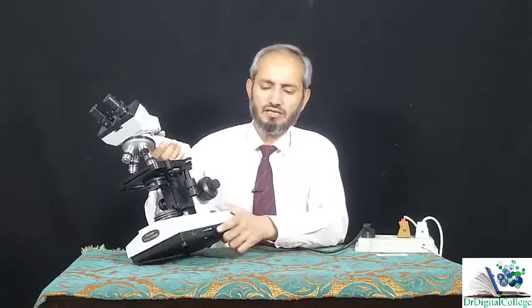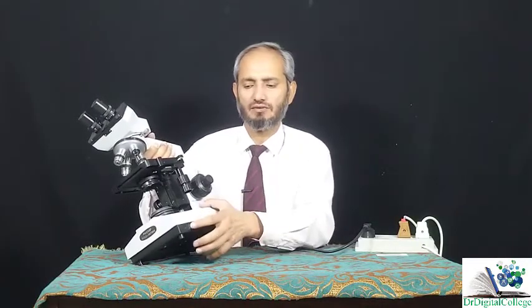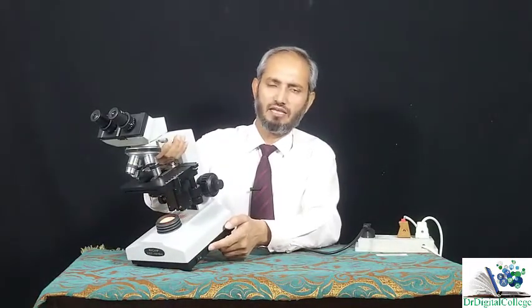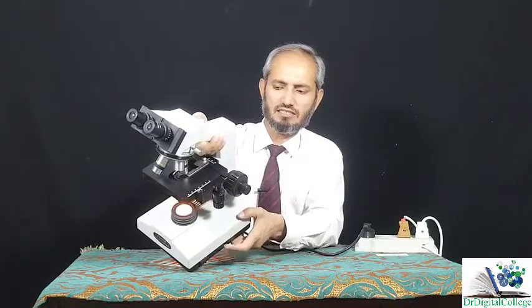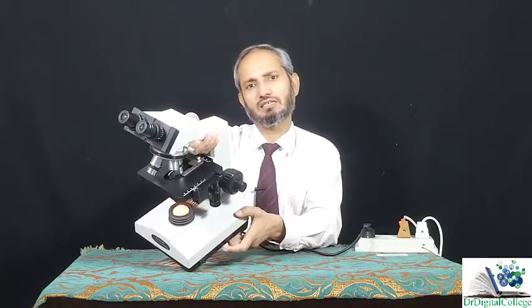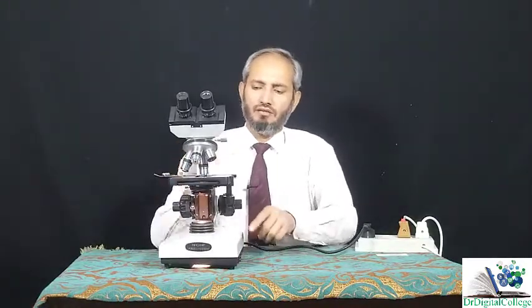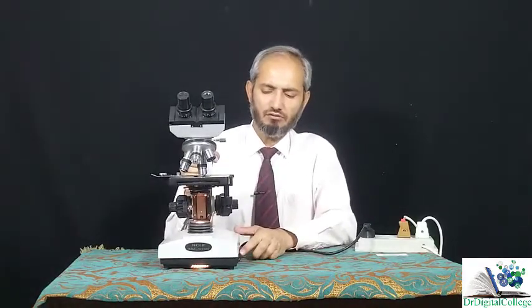Moreover, there is a dimmer here, or you could say a regulator, with which we can increase or decrease the intensity of light. For example, I have the light on now, and with this I can decrease the light and I can increase the intensity of the light. Look at this: you can see that the light intensity is being decreased here, and now it is being increased here by this button. This is the dimmer. For different focusing, we need different amounts of light. That's why we use this regulator of the light intensity to increase or decrease the light.